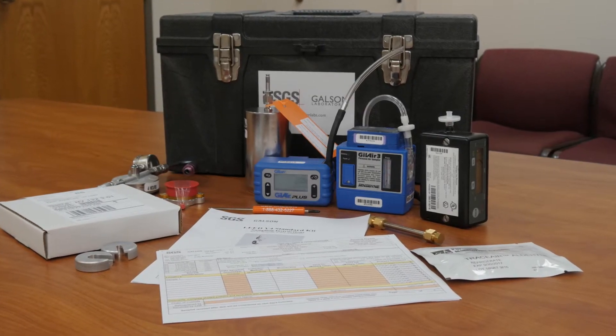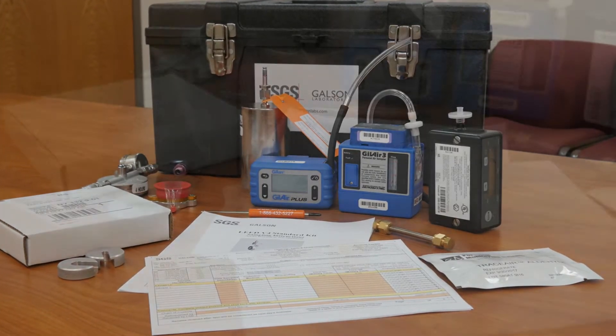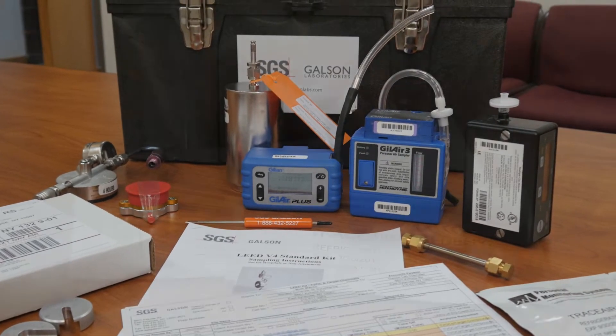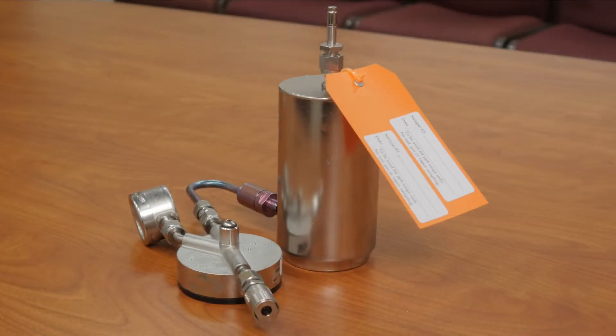Review the order to make sure you have received all of the equipment and media necessary for the sampling project. You should have received, along with their associated accessories: the correct quantity of Assay 580 passive monitoring badges — one blank and one for each sampling zone is required — and the correct quantity of stainless canisters and integrated regulators, one of each for every sampling zone.